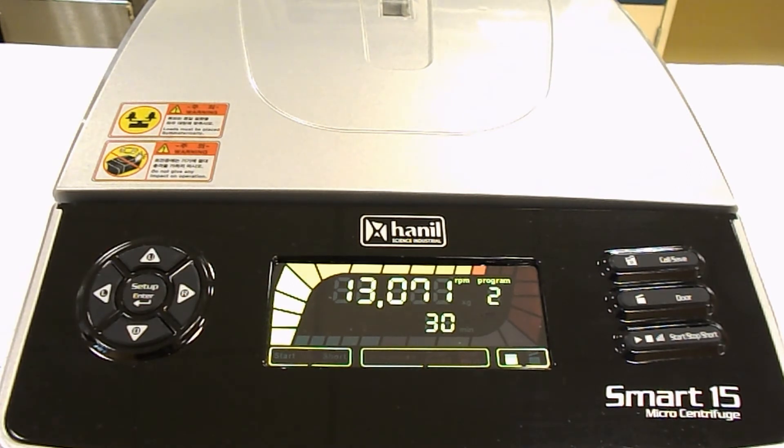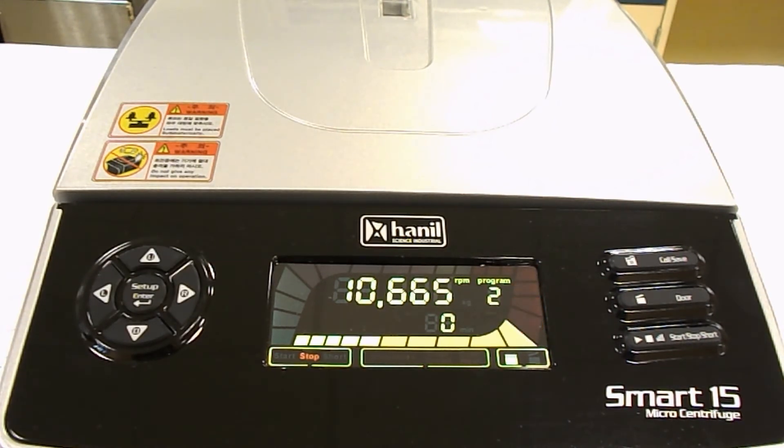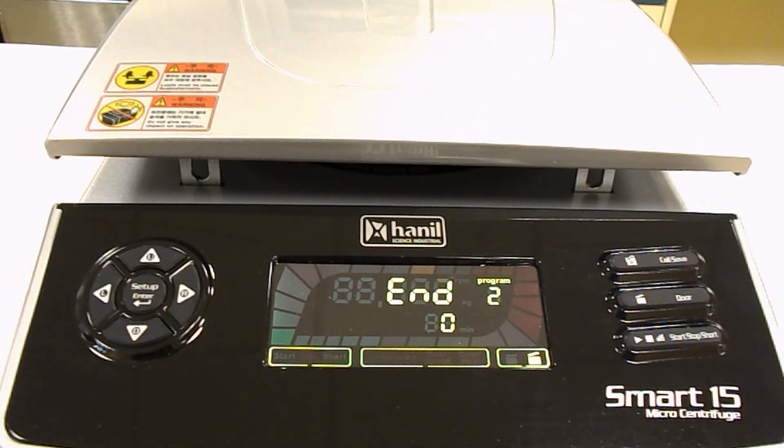It's going to hit its maximum RPM in just a few seconds, and that's when the timer will start counting down, as you can see there. It's fairly quiet for a machine that's able to spin up to 15,000 RPM and is this small — amazingly quiet. You shouldn't notice an increase in volume compared to microcentrifuges from any other manufacturer; in fact, it actually appears to be a bit quieter. Now it's spinning down from its top RPM and will hit zero in the next few seconds. As soon as it does, it automatically opens the lid and shows that your program has ended.